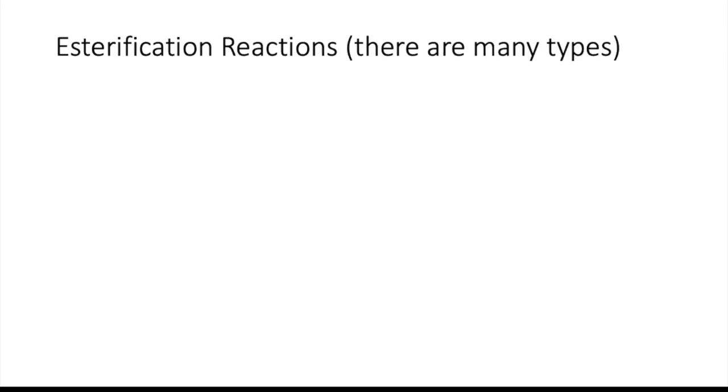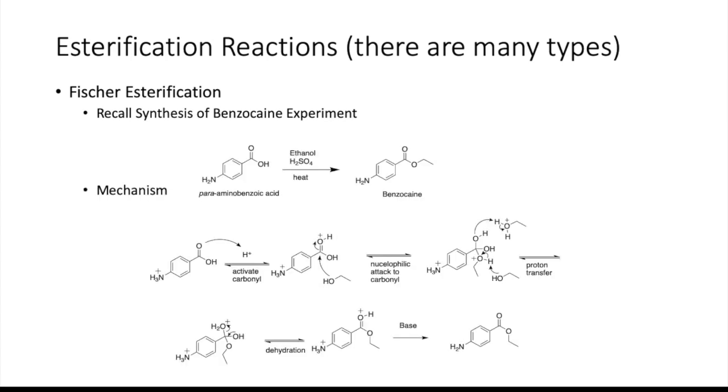The reaction that we'll be conducting today is an example of an esterification reaction. As you have seen in lecture and even previous experiments, there are a lot of different types of esterification reactions. Earlier in the semester, we showed you the synthesis of benzocaine, and that was going through a Fischer esterification mechanism.